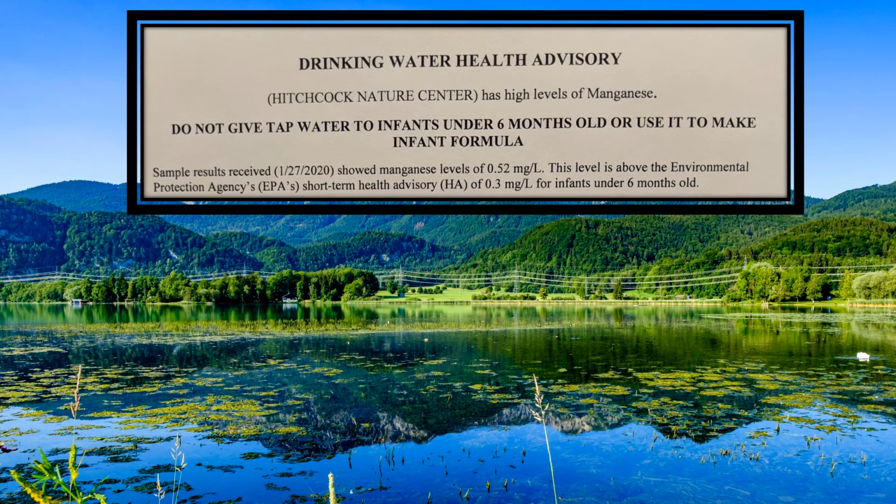It's really nice when you're doing this type of application work to know that you're going to have something other than water in your water samples. So when my wife told me, I said, well, that's great. We're going to have to go back and collect a sample so that we have plenty to work with going forward. This has proved to be very useful for application development, but also it allows us to see what the EPA testing showed with regards to the samples from this site.